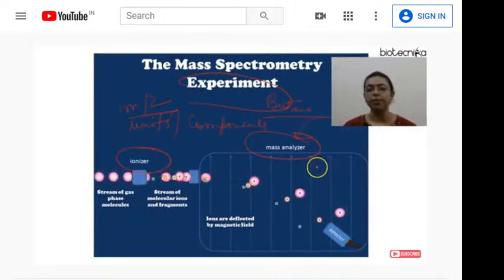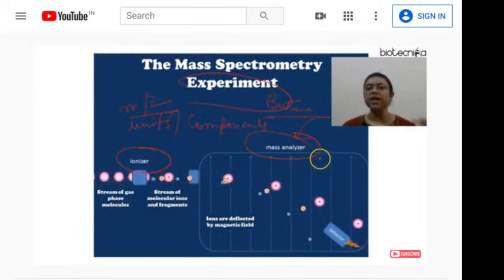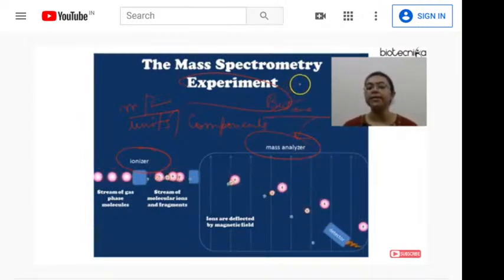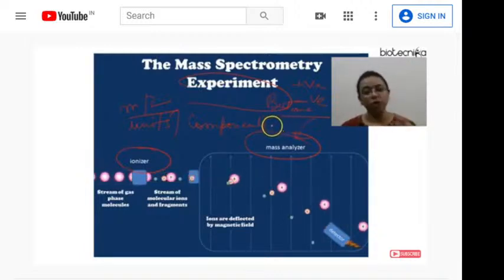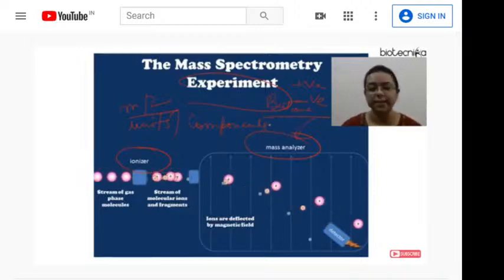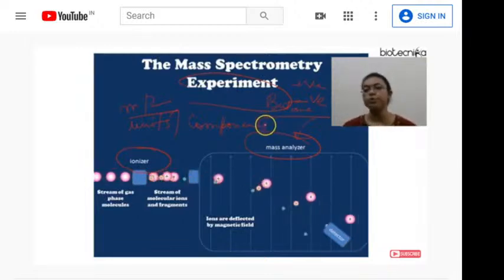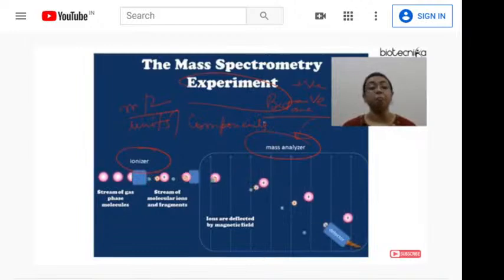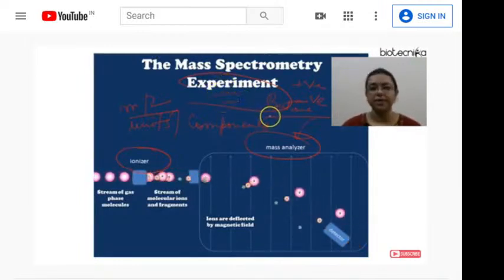Inside the mass analyzer, we have to come out with the charge compositions of that particular compound. So we know butane. Simultaneously. So if any compound is unknown to us and we want to deduce the particular charge status of that compound, then definitely we have to go for this experimental type, isn't it? And for that we need a mass spectrometric study.